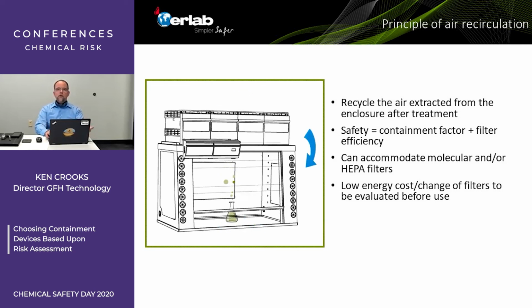And can also include HEPA filters. Generally, it's mostly 2 layers of carbon filters, but it can also include HEPA if you're working with hazardous particles or solids. Obviously, without exhausting all that air, you do not need to make up all that air, so that lowers in many cases, but not all cases, the energy cost. But you do have to include the cost of changing the filters. So a hazardous risk assessment for ductless hoods includes the life of those filters, not just if they'll capture and contain everything that you're using, but will they last long enough?